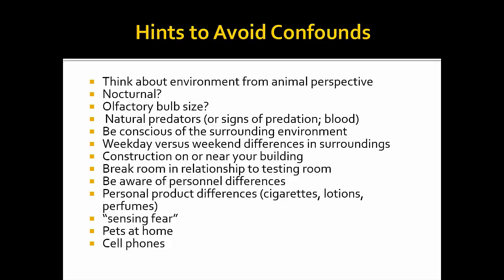You need to think about your environment from the animal perspective. Is your animal nocturnal? Does it have a large olfactory bulb? Is it going to be more sensitive to smells? Do you have blood or signs of natural predators? Noise level in your building, like do you do a study on a weekend versus a weekday?